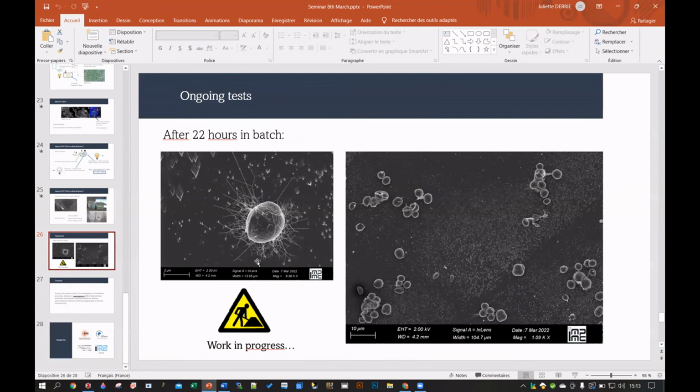In my opinion, the difference between strains may be that some produce more of this and so stick better than others. This one is sticking, but I'm not sure all the strains stick as well. Even in culture, some seem to stick really strongly to the plastic or the glass, other strains less.